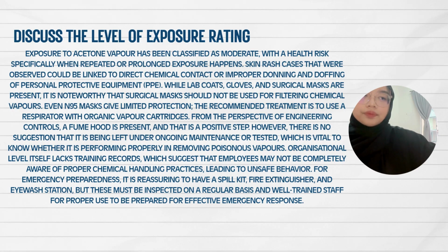From the perspective of engineering controls, a fume hood is present, and that is a positive step. However, there is no indication to know whether it performs properly in removing toxic vapors. The organization itself lacks training records, which suggests that employees may not be completely aware of proper chemical handling practice, leading to unsafe behavior.